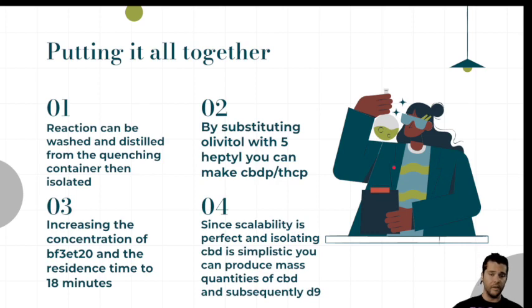I know some people that are even using muriatic acid, or glacial acetic acid, whatever it is that you're using there, that's your SOP and your laboratory procedures, but it can then be turned around to make that conversion. So you've mass produced large quantities of CBDP.